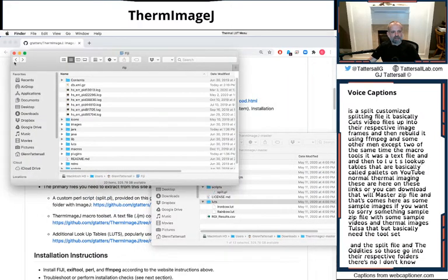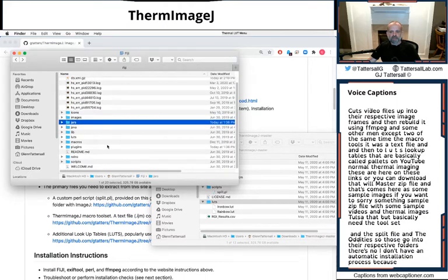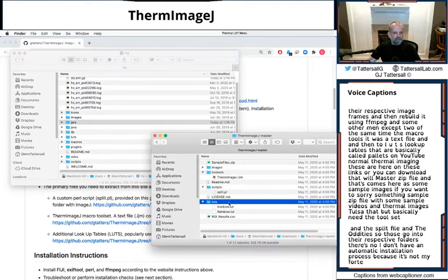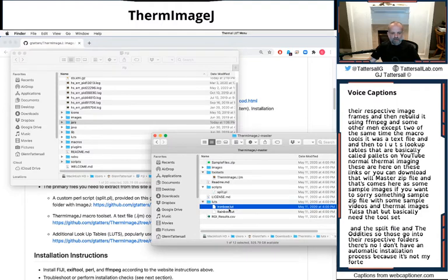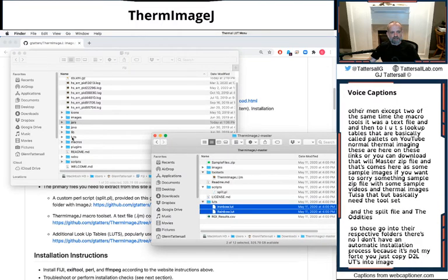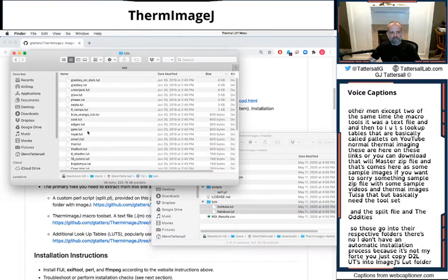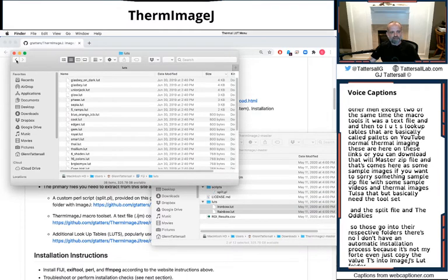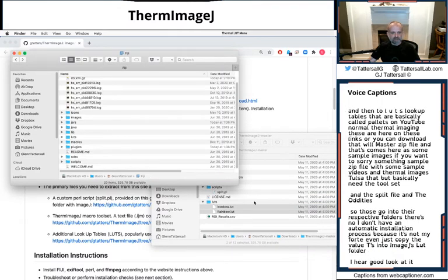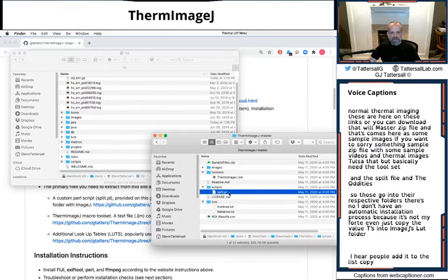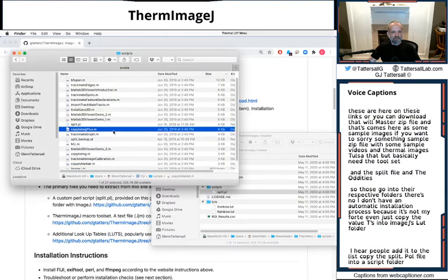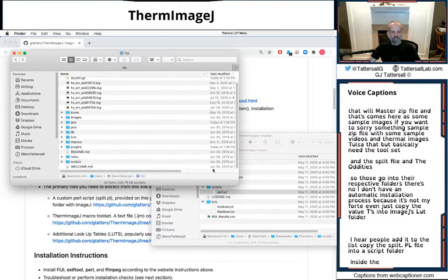I don't have an automatic installation process because it's not my forte. You would just copy these two LUTs into ImageJ's LUT folder right here. It'll add it to the list.